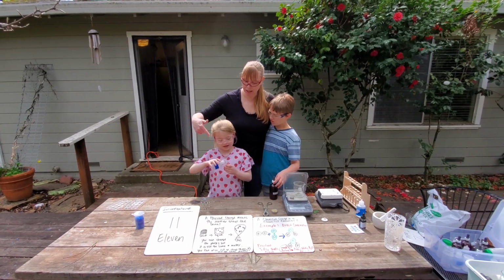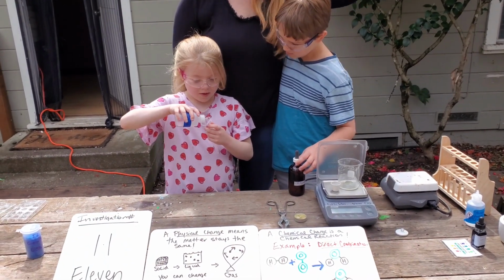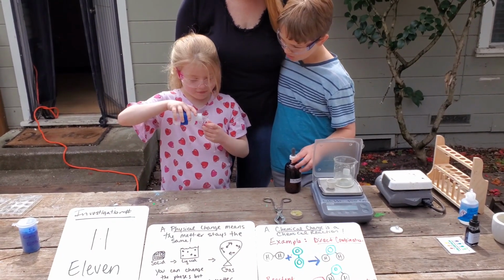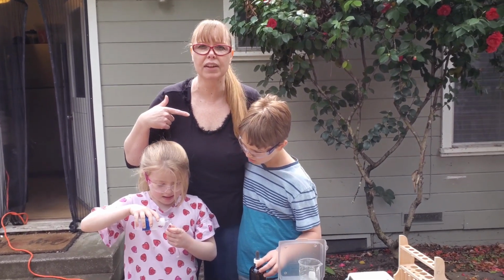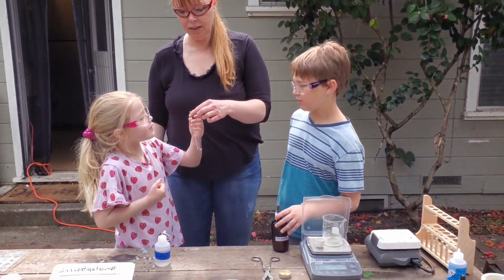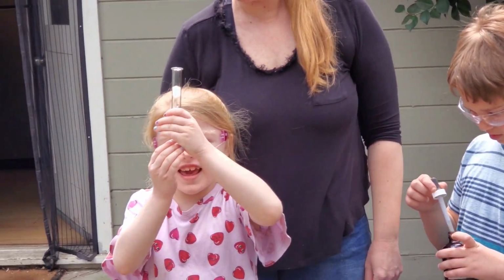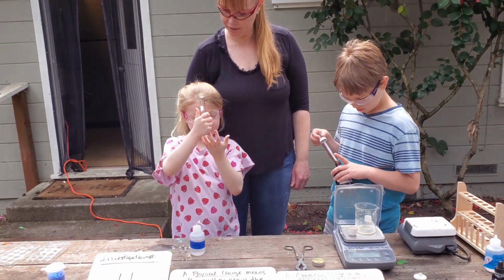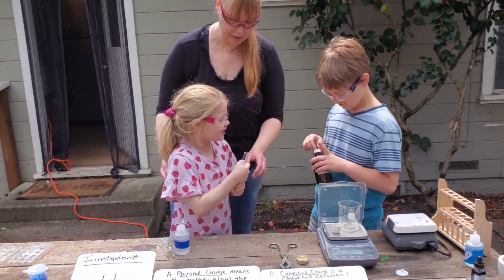On 11, Jules is going to add 10 drops of the baking soda solution that we just used in investigations 9 and 10. So watered down baking soda. And then Troy is going to add some silver nitrate. The silver nitrate is stuff that can turn your hands brown that we used in our last lab. Put it up for the cameras to see. What does that look like? Can you describe it, Joel? It is clear. Is it a solid, liquid, or gas? Liquid. There you go. So clear liquid.